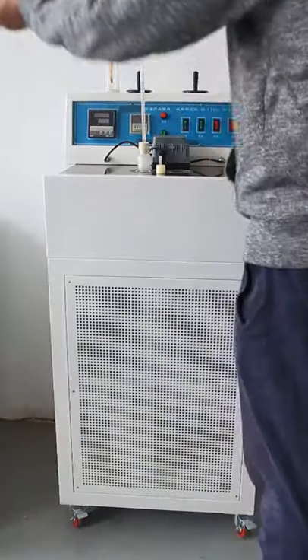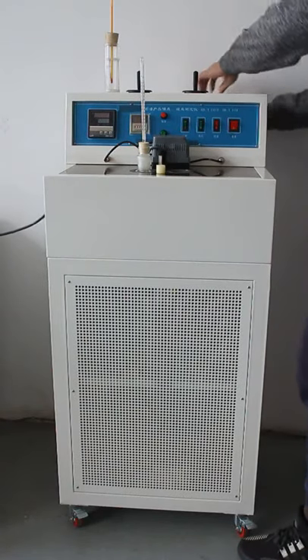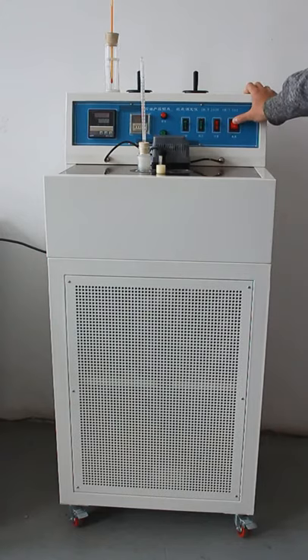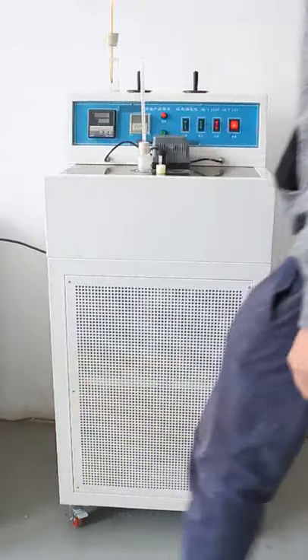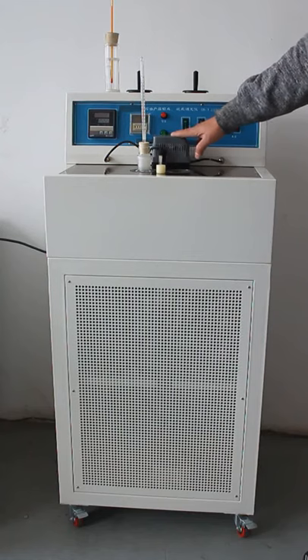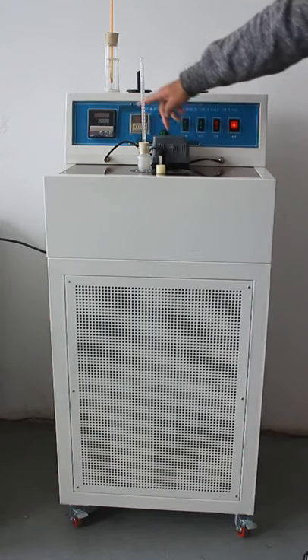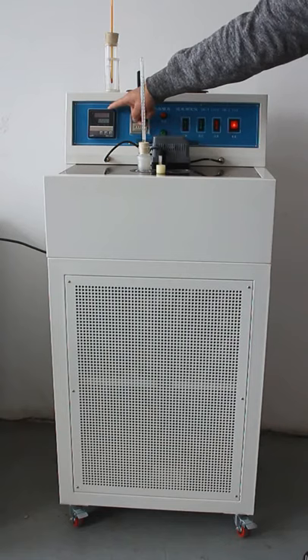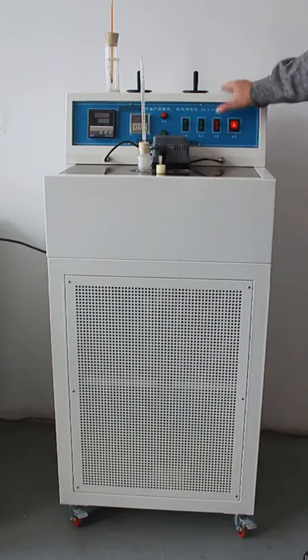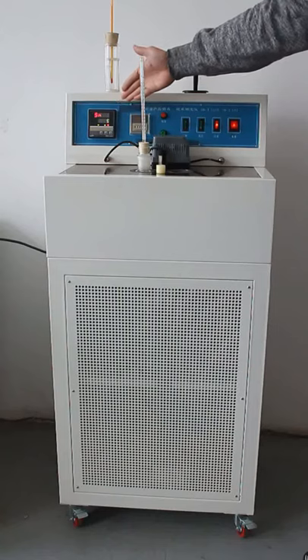Connect the power cable to the back of the instrument. Turn on the power switch. Once the power switch is on, the cooling box motor starts working. We can turn on the temperature meter. This is the temperature controller — it controls the cooling box. Turn on this switch to activate it.